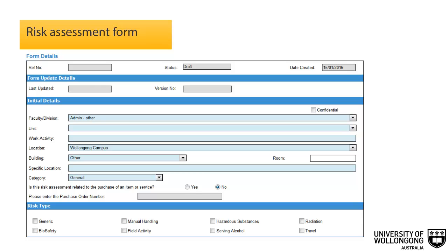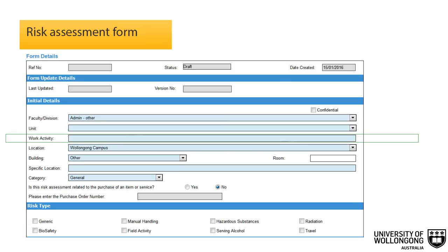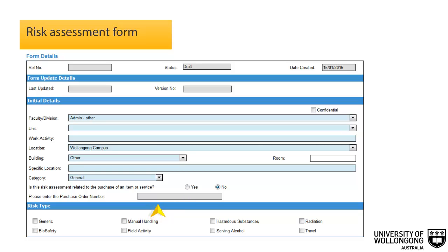We will now go through the process of completing a Safety Net risk assessment form. The initial details section identifies document ownership and provides search data. The faculty, division, and unit fields indicate the relevant area owning and developing the document. The work activity field is a brief title describing the work occurring. The risk assessment should also be categorized under the most relevant selection to allow searching of the document. The location, building, room, and specific location fields identify the site the risk assessment applies to. Where the risk assessment relates to the purchase of an item or service, select the Yes radio button and enter the purchase order number in the field provided.